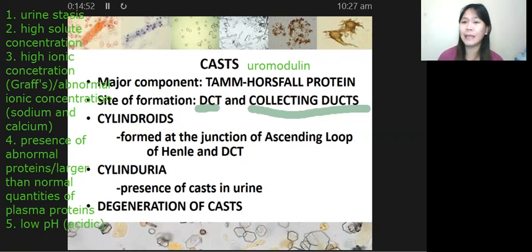Alright, so alam na natin yung subdued light na yan, okay? So sabi naman natin, whenever you examine a urine sample, always make use of a subdued light para hindi masyadong bright, okay? Makikita natin yung ating mga sediments. Because, ano ang sabi ko? Sediments, they usually have a low refractive index and they have a similar refractive index to that of your urine sample.